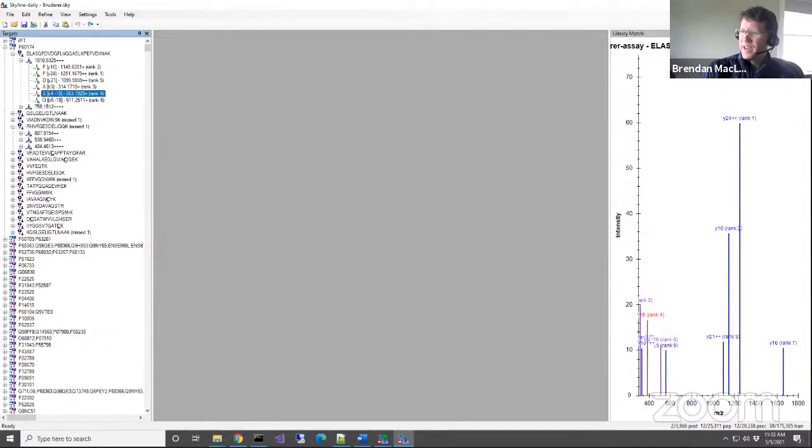Forgot whether the iProphet file can also be used in this case. What settings can you change to be more restricted in regards?